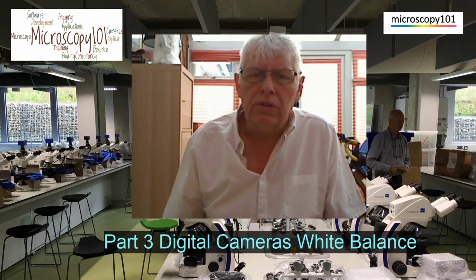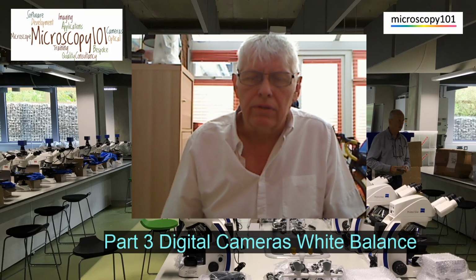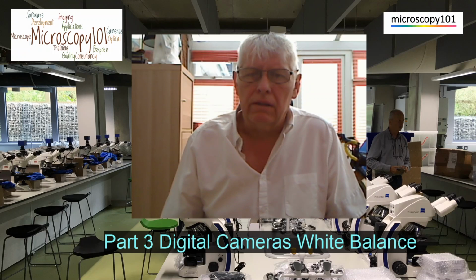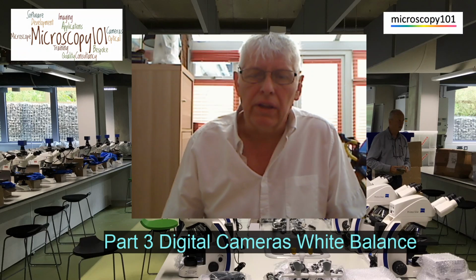Hi, welcome to the Microscopy 101 channel, and today I'm going to talk about digital cameras, specifically the white balance setting or color correction. Frequently when we collect images on the microscope, we would like the images to be as we see them down the eyepiece, and frequently these images may be the wrong color, and it's a common complaint for digital cameras, particularly on microscopes. So I'm going to talk a bit about how we get the right setting for that.